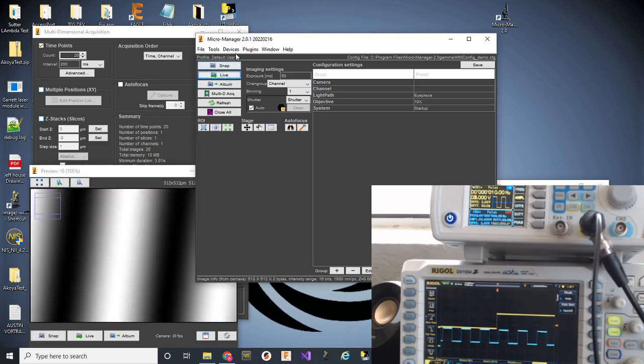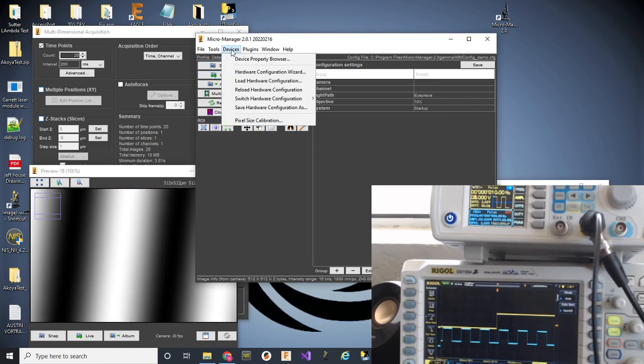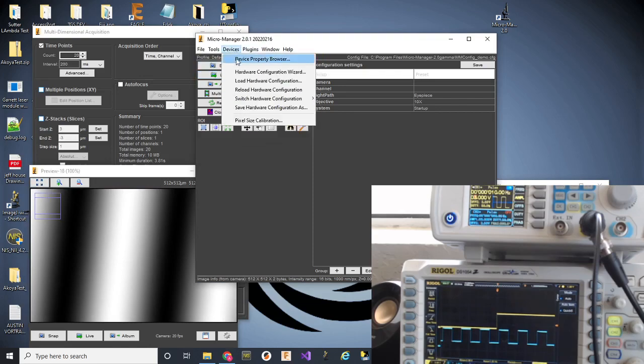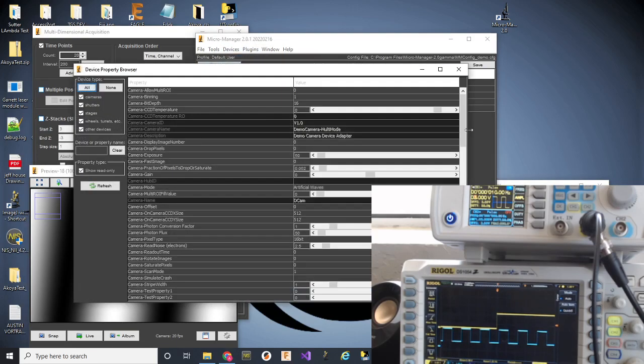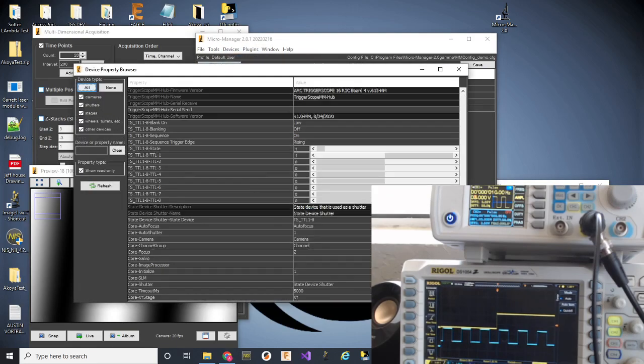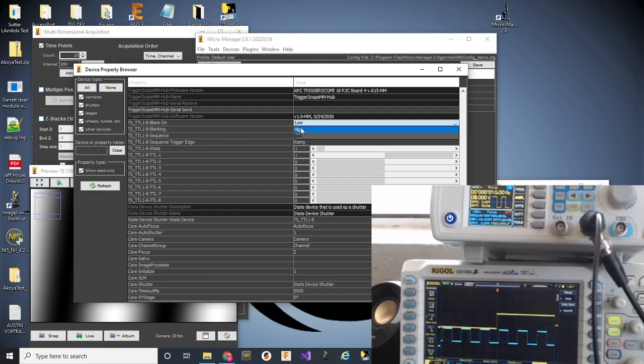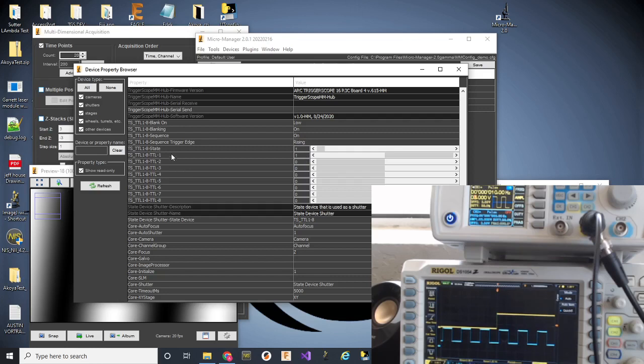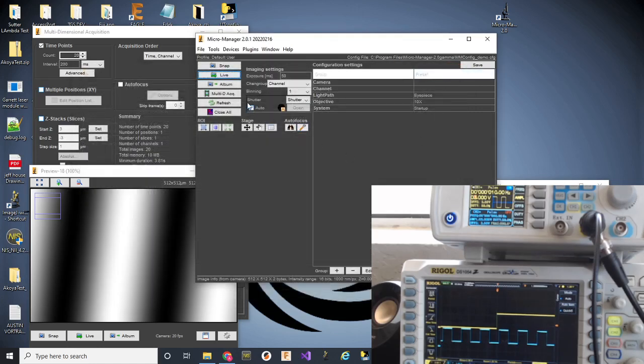So, now, we're going to turn on blanking. If we go to the device menu and then device property browser, trigger stuff is down at the bottom. We have this TTL1 through 8 blanking. We have blank on low or we can choose high. In our case, we want low. And we're going to turn on TTL1 through 8 blanking. That says if any channel, TTL1 through 8, if any of them happen to be on, we don't want them to actually turn on unless that blanking line goes active.